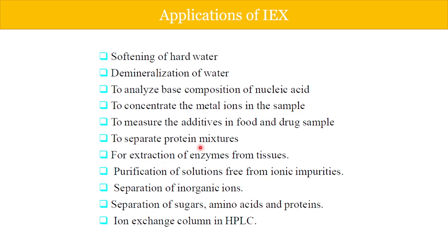Then when you are separating protein mixtures, then extraction of enzymes from tissues, then it also helps in the separation of inorganic ions, then the separation of sugars, amino acids and proteins. Also, it helps in the purification of solutions, which are free from ionic impurities.